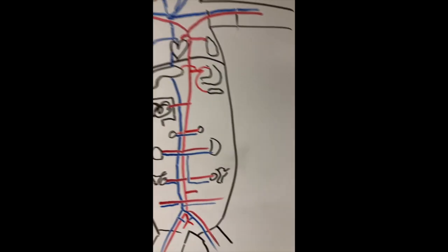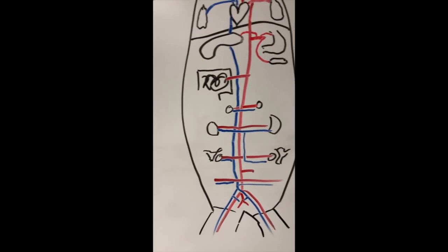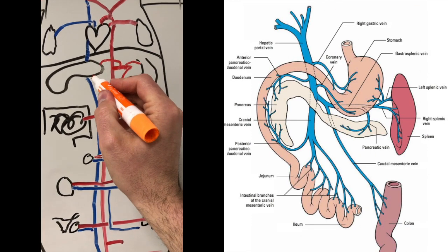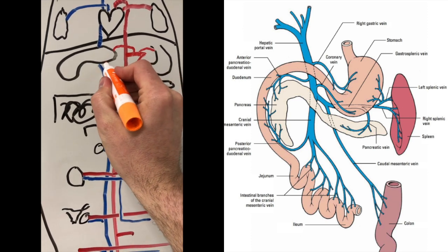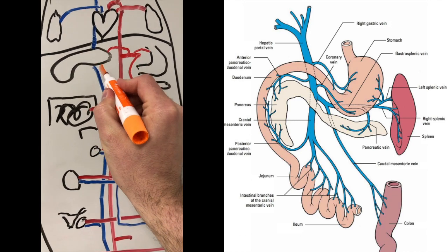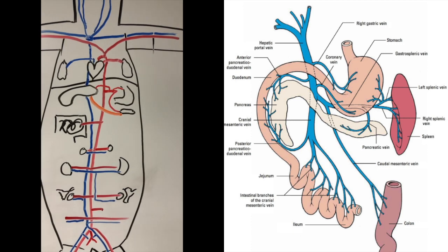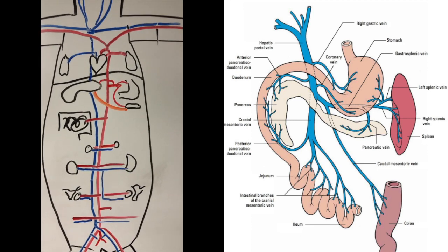If you want to think about this like a river system, I would draw the headwaters of the liver system. The portal vein enters in the bottom of that lobe of the liver. So I would draw it to start off from the spleen directly to the liver.